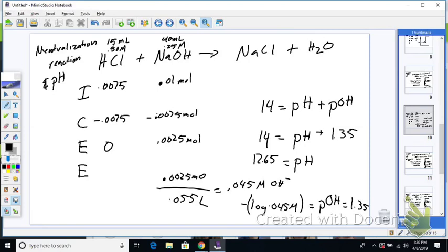Now, here's the deal. When you guys do these titrations, you got to realize the pH is super, super sensitive. You put it in, and the numbers kind of move around, and they don't really settle for a while. All it has to be is off a little bit on the pH, and you're going to be off from your calculations to what it is. So there's variables. Did I make up the 0.25 molarity correctly? Okay, because there's error when I make up solutions. There's going to be a little bit of error because it's not going to be perfect. I try to do the best I can with what I have.